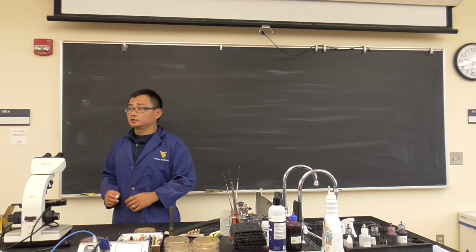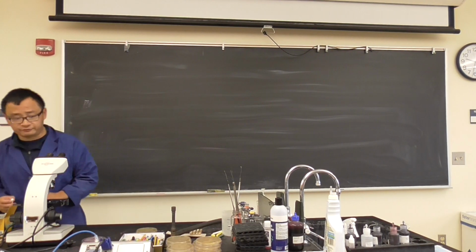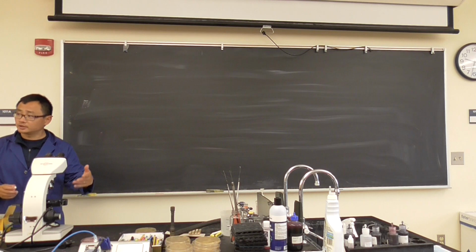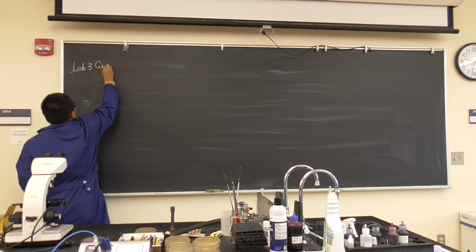As scheduled, we're going to move on to the Gram stain today. We're going to do about 15 minutes of opening remarks, and I'll show you how to do the Gram stain, and then you do it by yourself. So in lab 3, we will talk about the Gram stain.